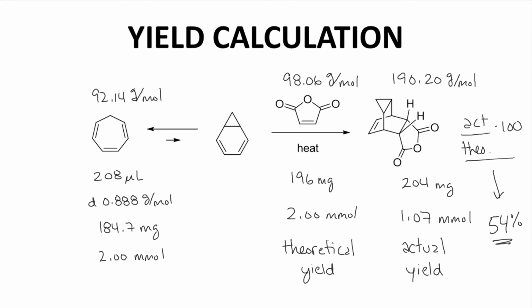Wonderful. I admit that our reaction reference got a yield of about 90%. There are probably two reasons for that. One, they ran the reaction on a larger scale. Larger scale reactions sometimes allow for the minimization of product loss. Two, they had a more involved product isolation process. In simplifying the isolation, I sacrificed some yield. Regardless, around 50% is good enough for us to make a useful amount of material.